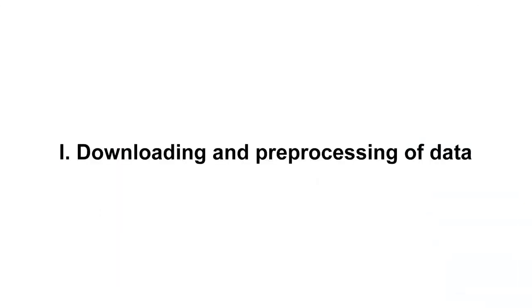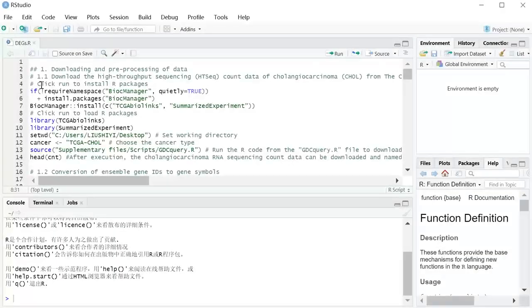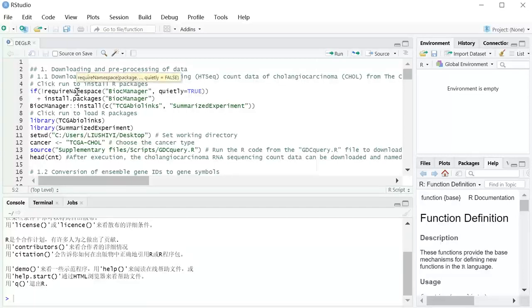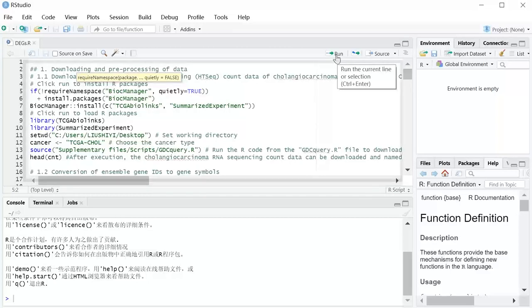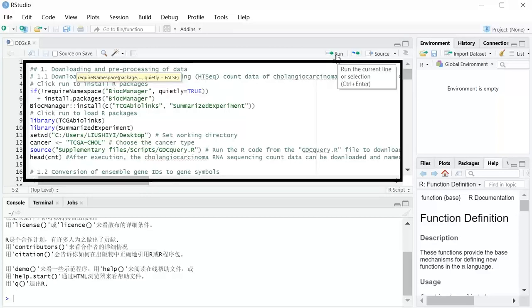Section 1.1: Downloading and preprocessing of data. Download the high-throughput sequencing count data of cholangiocarcinoma from The Cancer Genome Atlas. This step can be easily achieved by the following code.